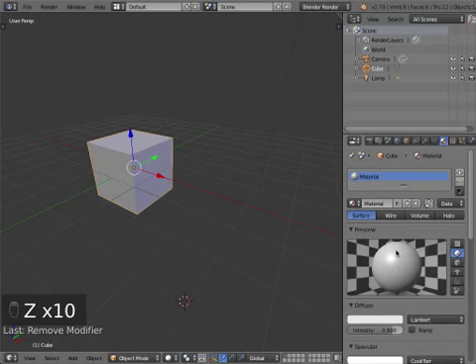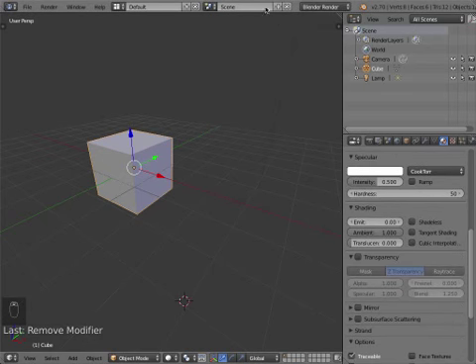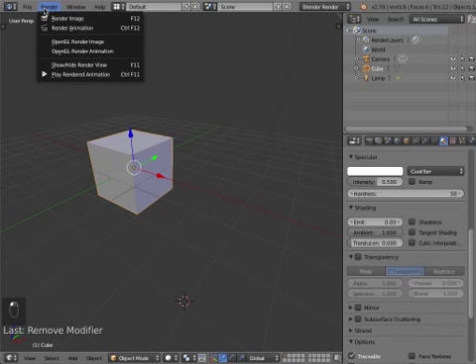And materials is one of the other very, very important things we're going to be working with. So think of a material as the color of your object. It does, of course, more than just coloring the object, but that's the color of your object. And note we're still working with the Blender render, so the internal render engine. We'll use Blender render, and we're going to use OpenGL directly, so we can just render out whatever is in your viewport.